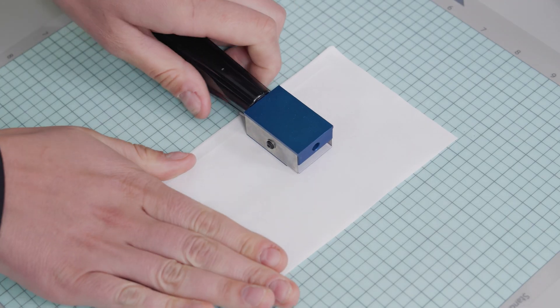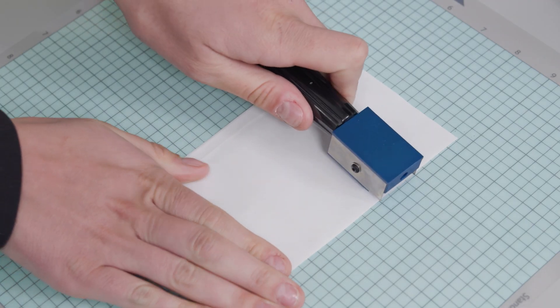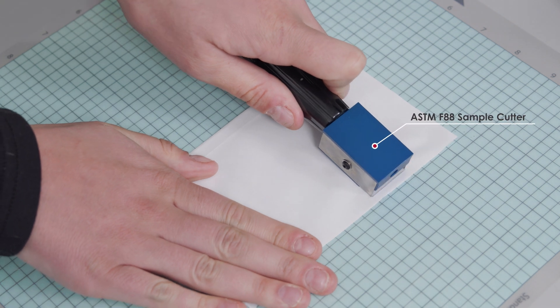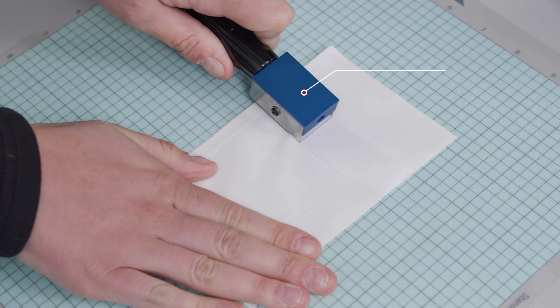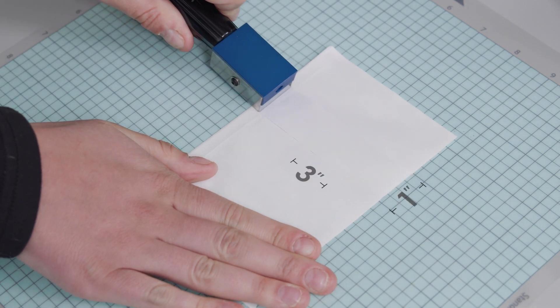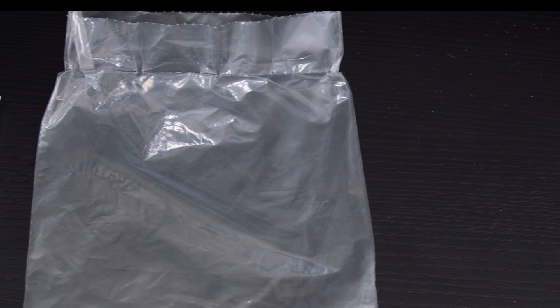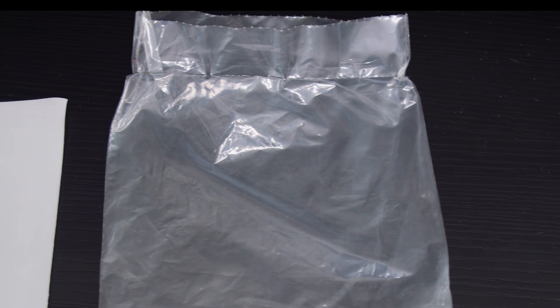When preparing specimens, raw materials should be cut with an ASTM F88 sample cutter with dimensions of 1 by 3 inches. Finished packages must be tested while empty.